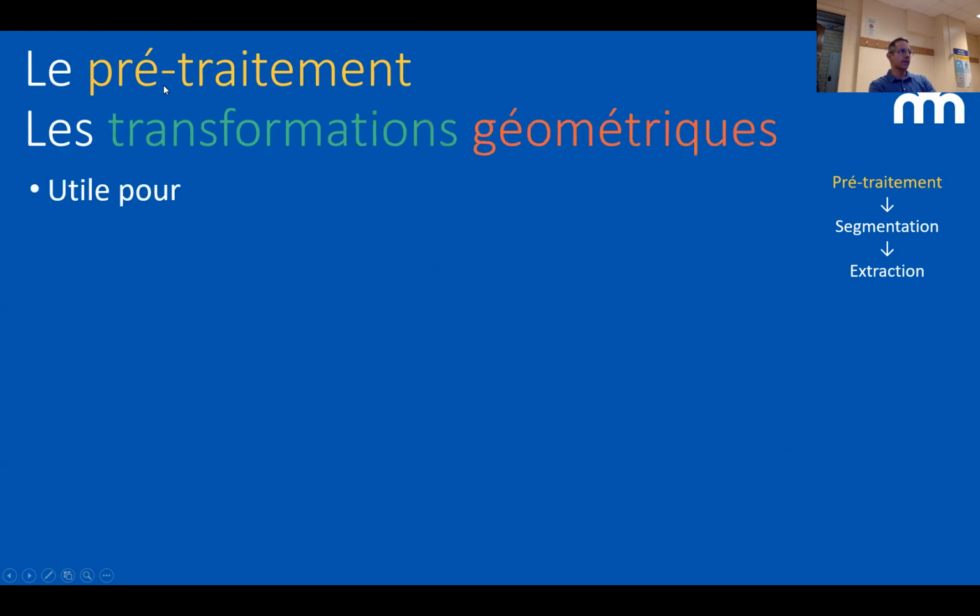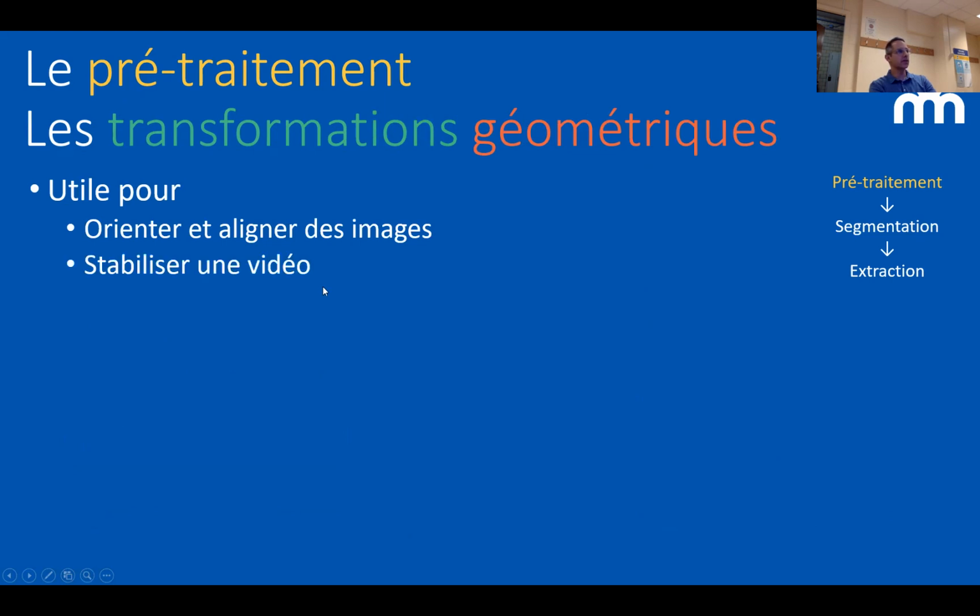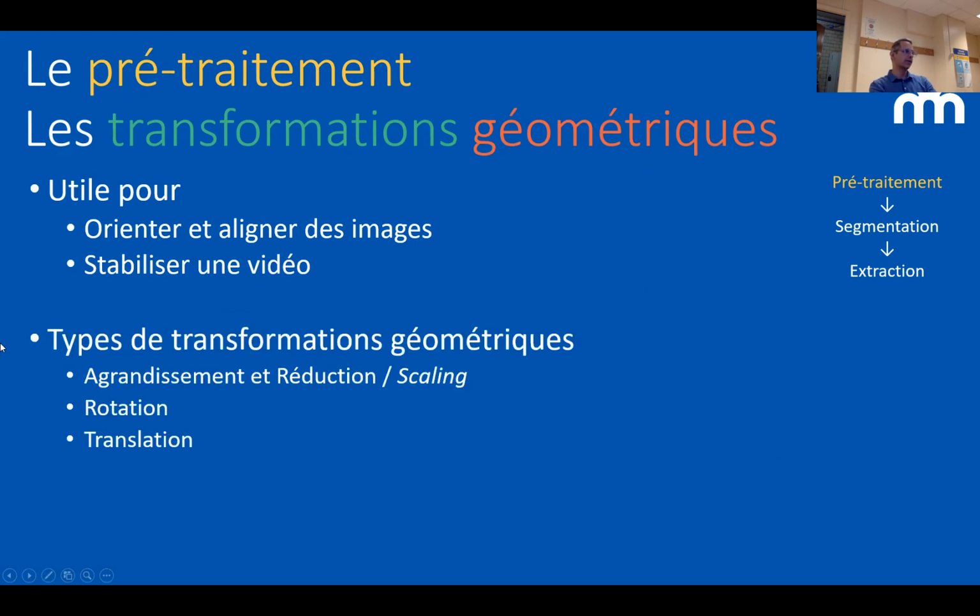The second pre-processing we can do is a geometric pre-processing. If you want to orient or align images in the same direction, this is very useful. Also, if you want to stabilize a video, if you know that something is making your image move and you want to stabilize it over time, this is usually a geometric transformation you can do.